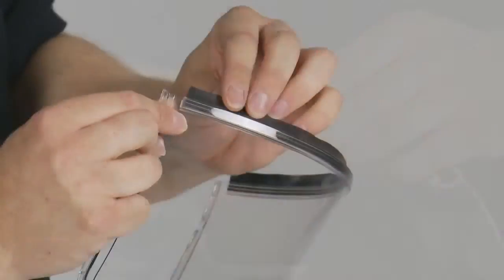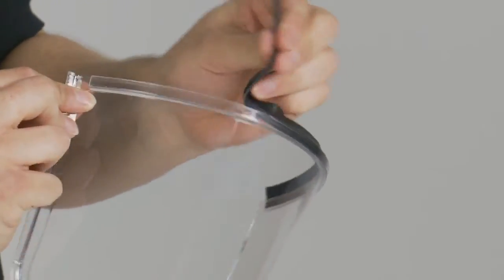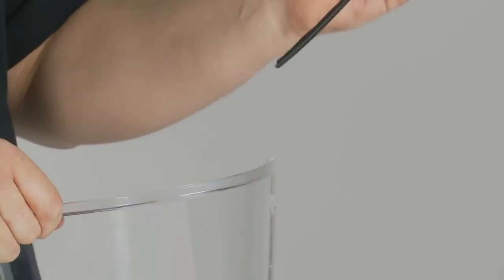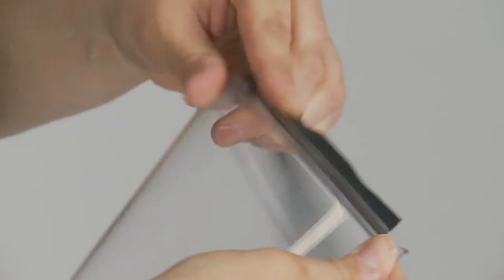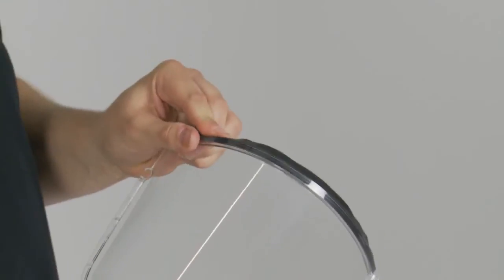The visor seal can be removed simply by pulling free from the groove along the top of the visor. This groove can be used to attach various accessories. To replace the visor seal, align at one end of the visor and push the gasket into the groove along the whole length to hold it in place.